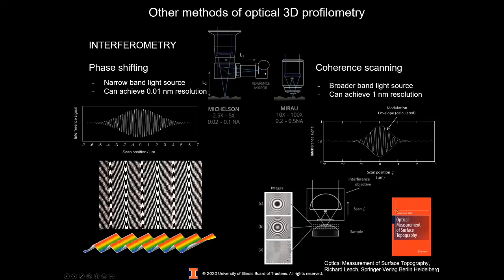For a more in-depth view of not only interferometry, but all the methods that we mentioned so far, I highly recommend the excellent book by Richard Leach, Optical Measurement of Surface Topography. Several of the images here are from that book.